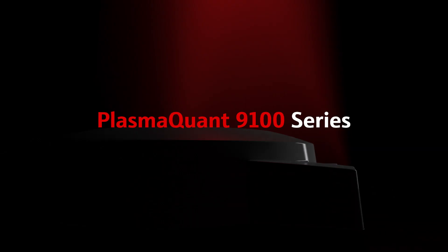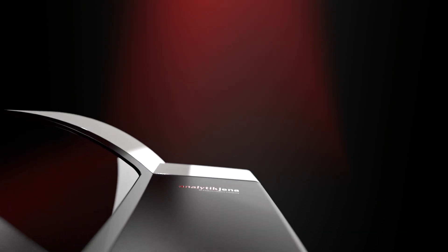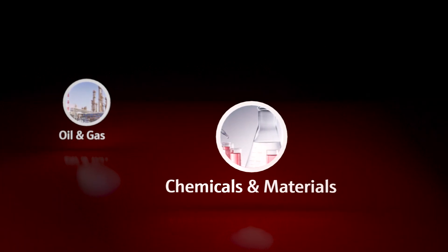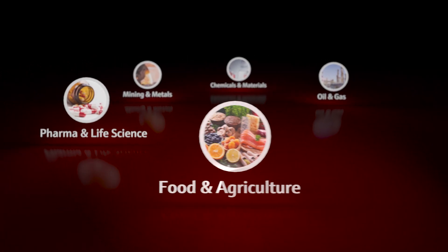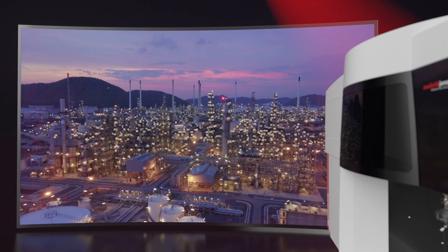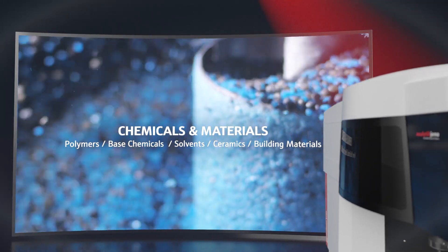Reveal the details that matter with the PlasmaQuant 9100 ICP-OES. The PlasmaQuant 9100 delivers the most accurate and precise elemental information in any sample type, including your most delicate applications. Ensure highest product quality and process efficiency with regulation compliance across many industry segments with this high-performance ICP-OES.